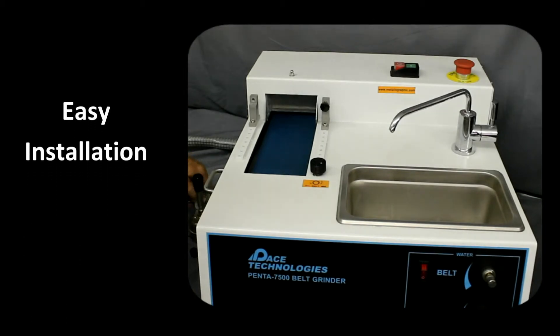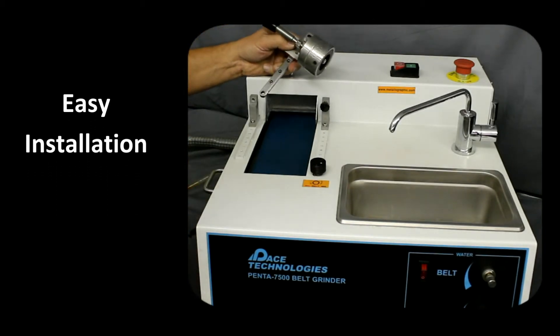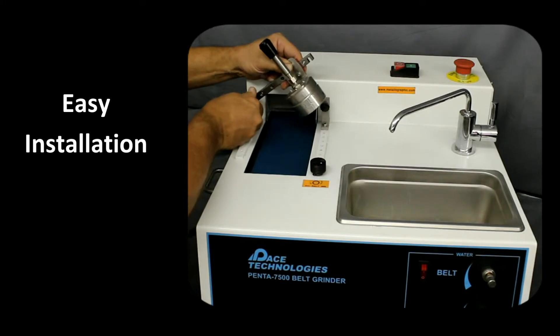The grinding attachment can be easily removed for greater access to the grinding belt. To reinstall, attach the left swing arm and reload the mounted specimen.